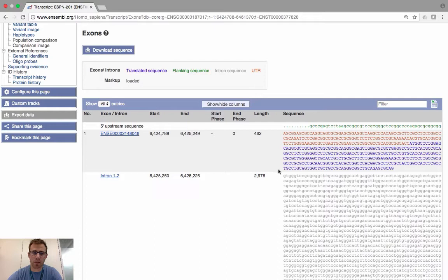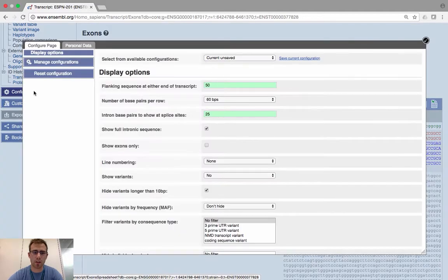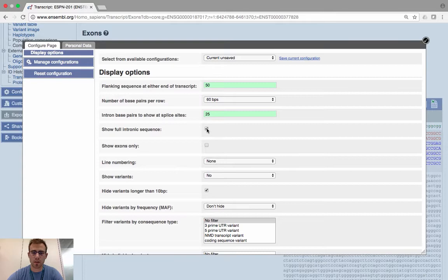By default, you may see only a very small amount of intronic sequence. You can change the sequences you're viewing by using the Configure this page option. Click on Configure this page and you'll see options to format the data with different annotations. What I've selected is Show full intronic sequence — you may not have this on by default, so select it and then save and close the window.